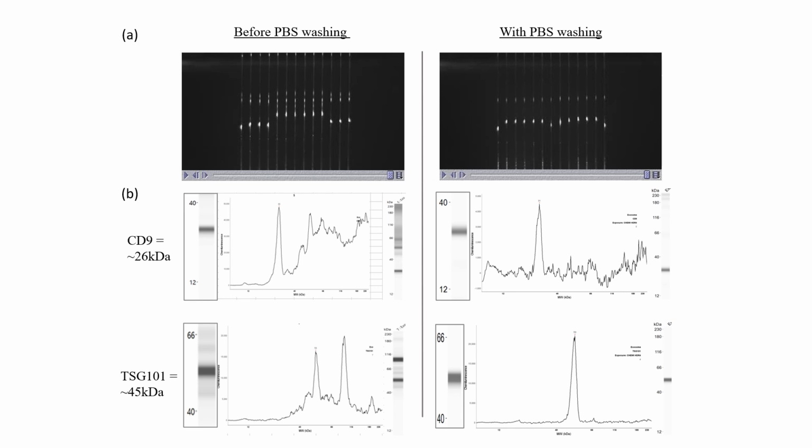This resuspension might be insufficient to remove all remaining polymer sticking to the exosomes. As this polymer is soluble and easily dissolved in water, it could be washed with PBS and spun down again, even though we might lose some of the original pellet.